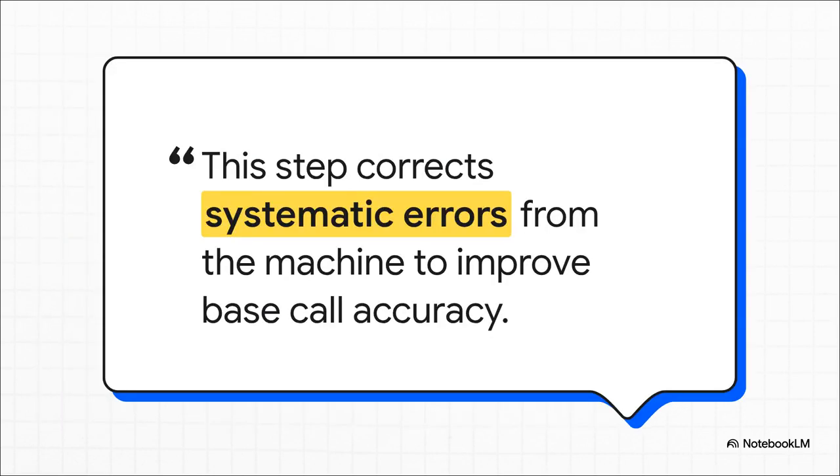I mean, think about that. This step is essentially teaching the machine how to correct its own mistakes, and doing this dramatically improves the accuracy of everything that comes next. It's our final cleanup, making sure our data is as pristine as possible.